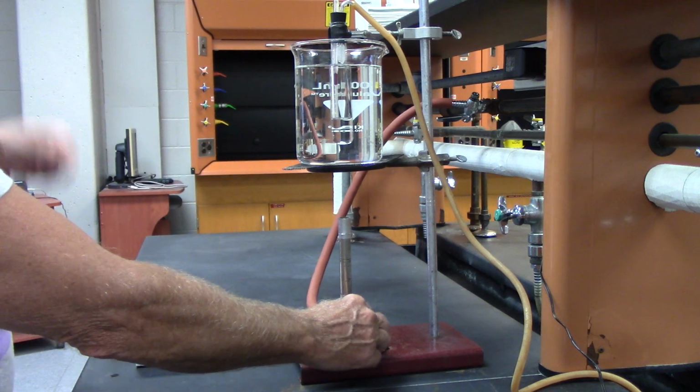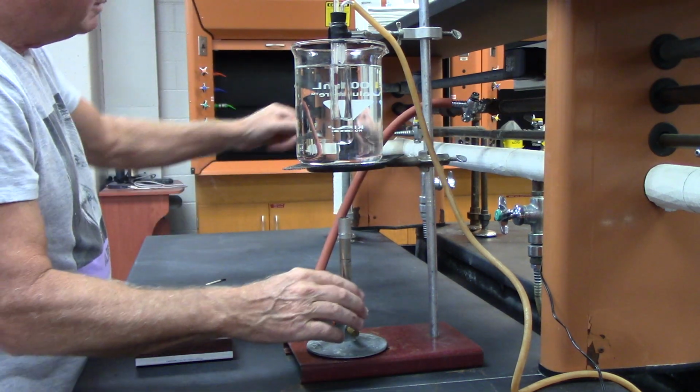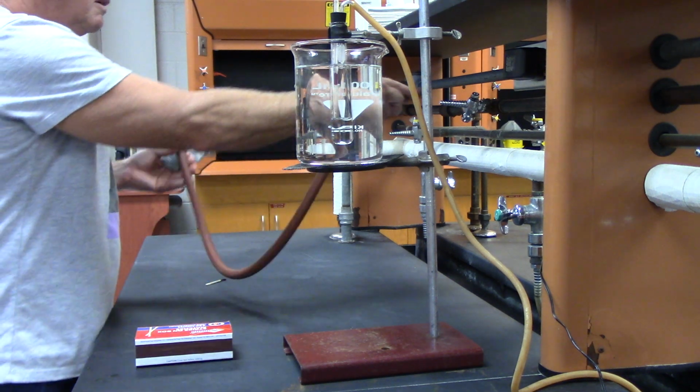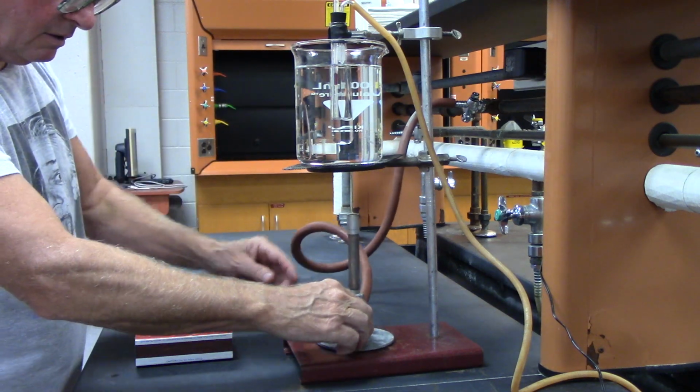All right, I've got a bad Bunsen burner. I'll have to replace my Bunsen burner. Sorry about that. Some of these things need to be better.